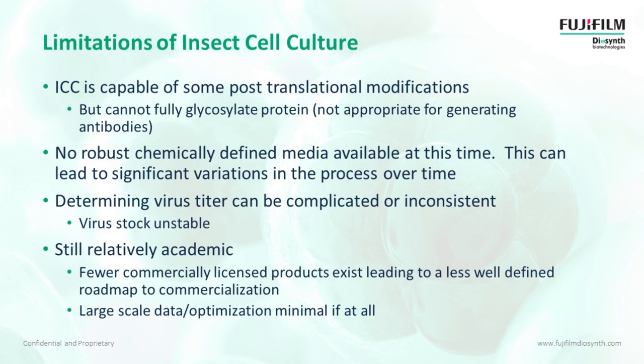media companies might take issue with that, but one of the reasons for this is that the culture needs for the cell line tend to be very different than the culture needs once you infect it with a virus, when the cells are kind of struggling to reproduce and divide. So the nutrient needs tend to be a lot different between those two stages.